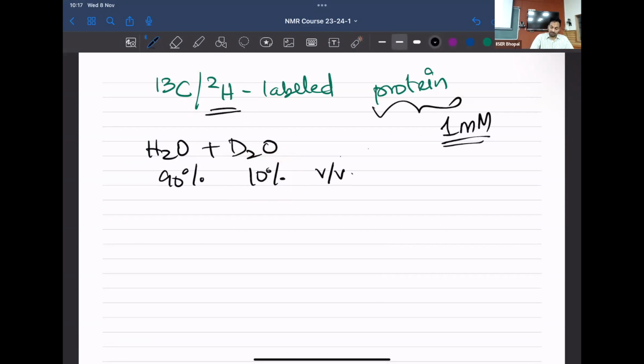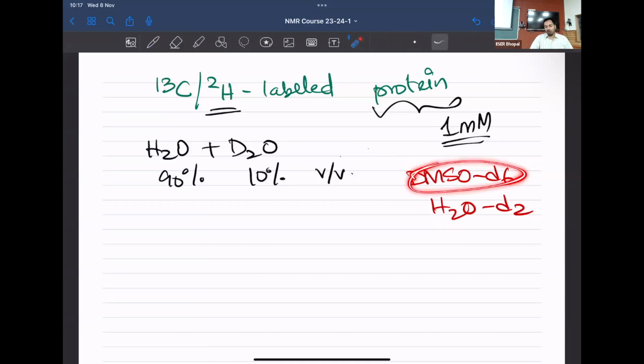I know where you're taking this question. There are times where people have two different deuterated solvents in their solution. For instance, let's say you had two deuterated solvents in your mixture. This would cause trouble with locking. Will you lock with DMSO-d6 or D2O is the question, right?